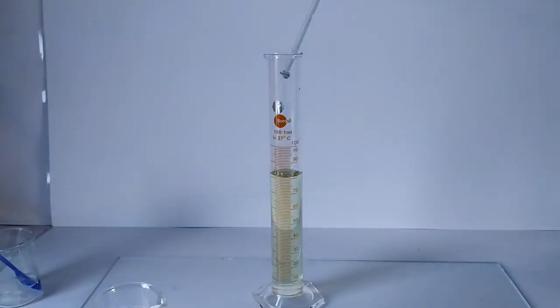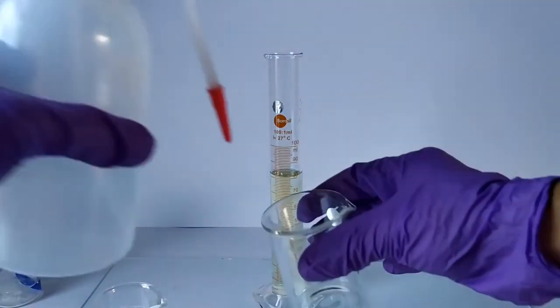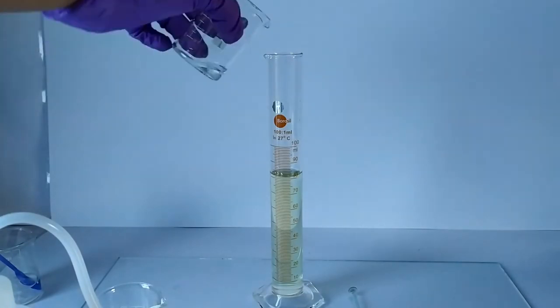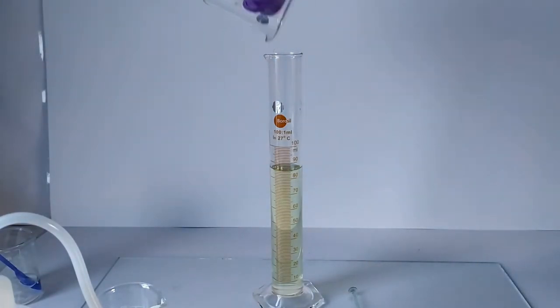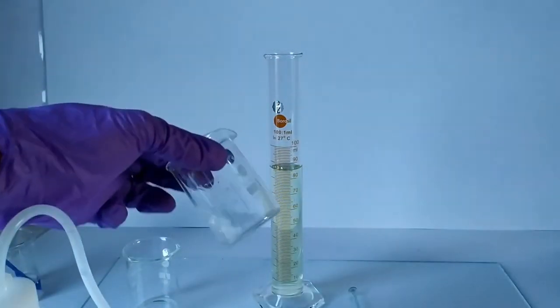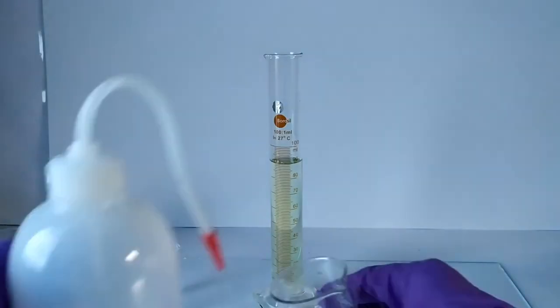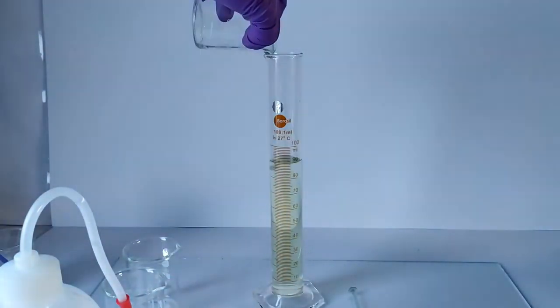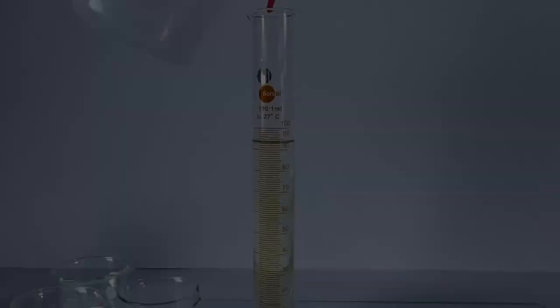Rinse the stirring rod and the three beakers used to contain the three solutions at the start of our preparation using minimal quantities of distilled water and pour the rinsings into the cylinder or flask. This ensures complete transfer of all traces of the reagent components into the cylinder.